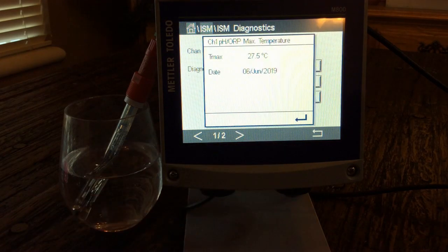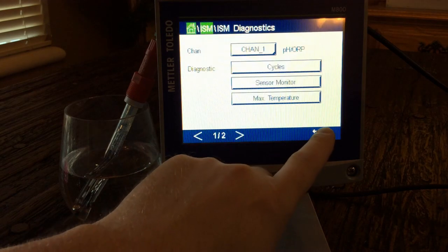Another thing it gives you is max temperature — the date and the temperature that it saw. That's great to know because if somebody happened to steam out a line and fried your pH sensor, you can come here and see if it reached a temperature outside of its specs.